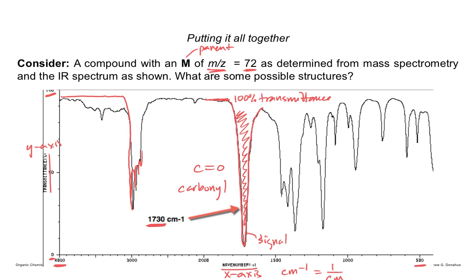So it's my teaching philosophy that for this class, I'm not going to go into the mathematics of this, like why that signal occurs there, why it has that shape, the intensity, the span of wave numbers. Really, it's very qualitative, and you're looking at the region and how the shapes appear.